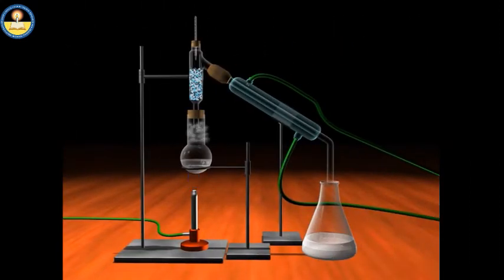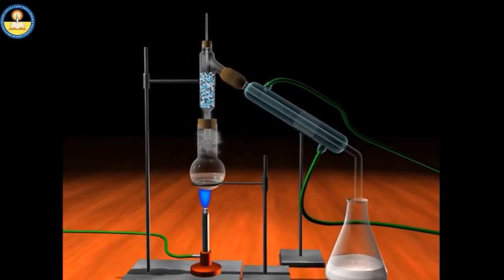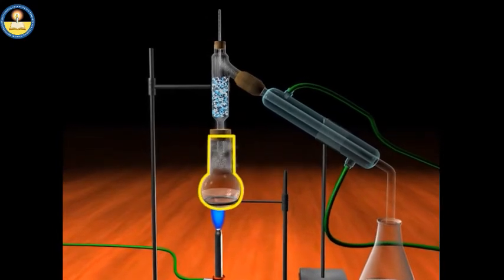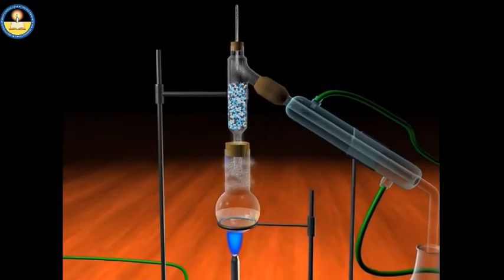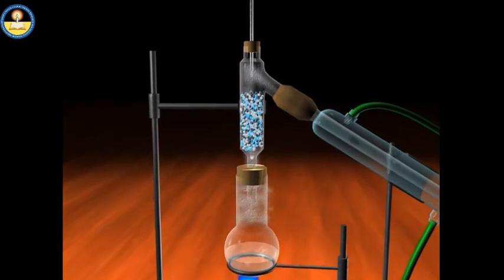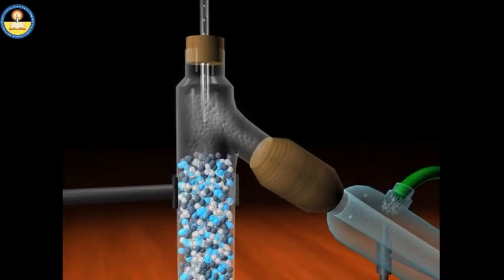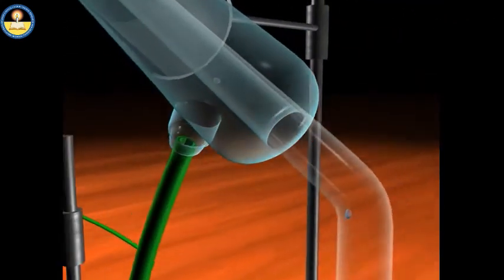Fractional distillation apparatus has a long column tube filled with glass beads. This long tube is fitted at the top of the flask as shown in the animation. The purpose of the long column fitted with glass beads is to help in separating liquids having close boiling points. Repeated vaporization and condensation at the surface of the glass beads ultimately helps in separating liquid mixtures into pure liquids.